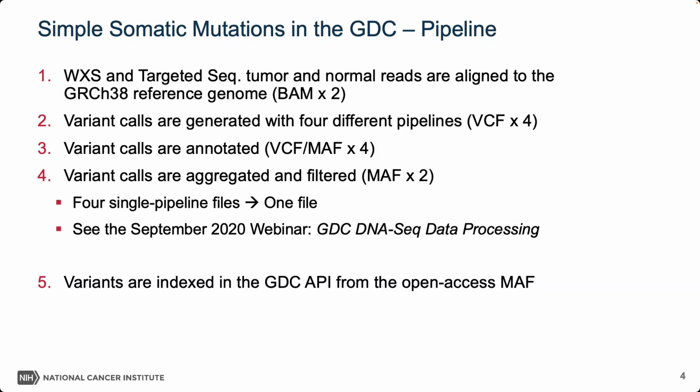If this is something you run into, something I recommend doing, a nice trick, is to filter your files down to a certain list and then sort it by file size. And you'll see that the header ones are always very close in size, and then when you actually start to get more mutations, you'll see the size jump. So if you sort them and are only interested in the files with mutations in them, you can see pretty easily through the size.